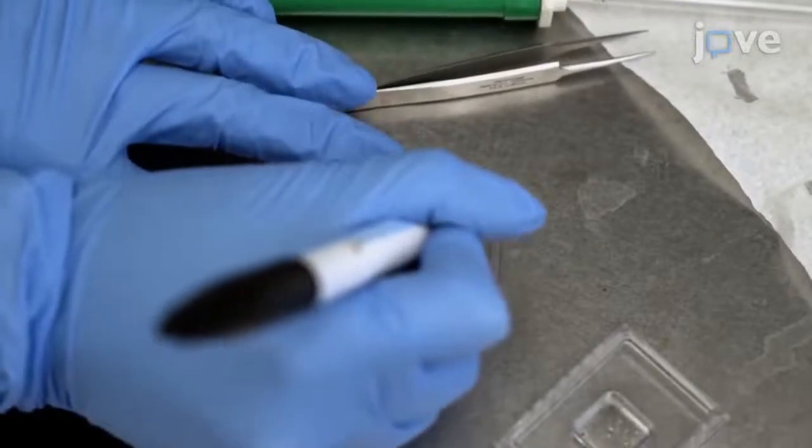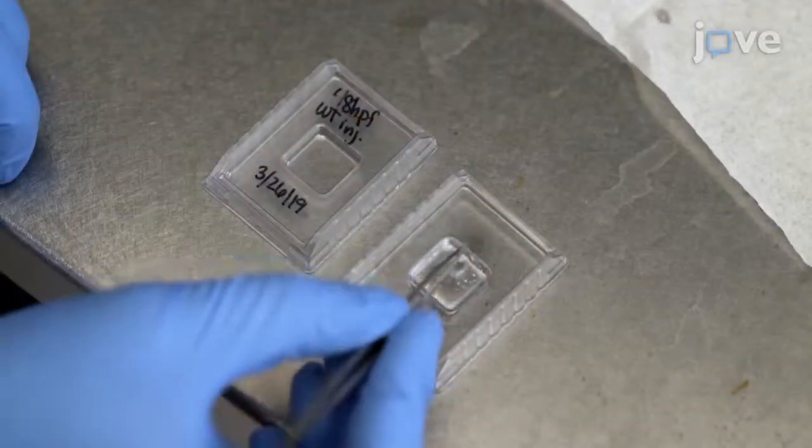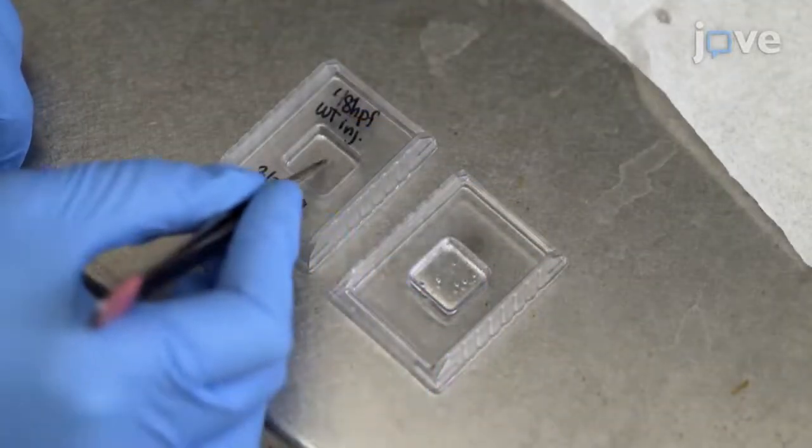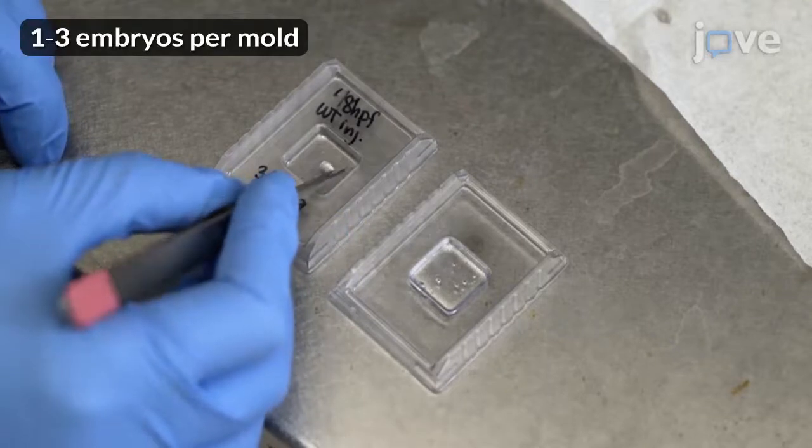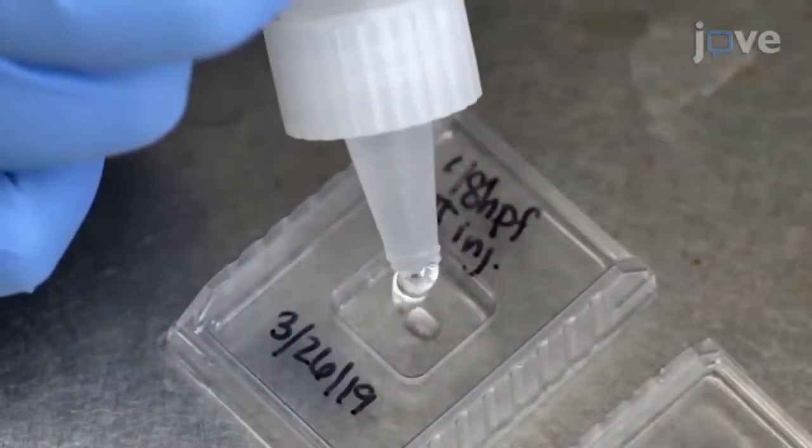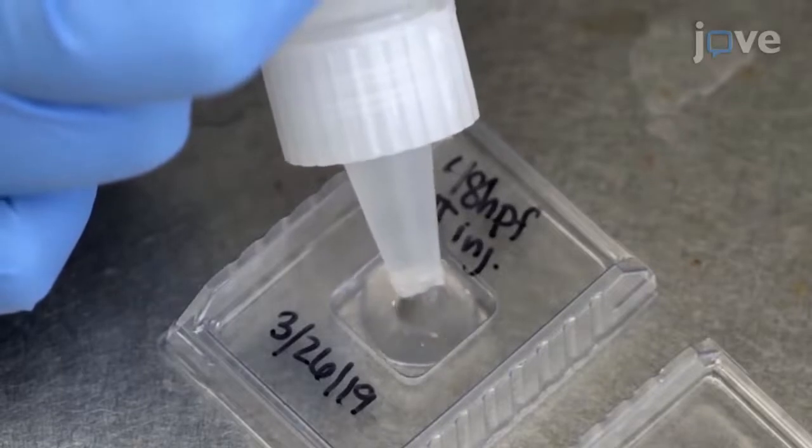Prepare labeled plastic molds and transfer desired embryos into the empty labeled plastic molds, minimizing carryover of OCT medium. Then gently fill with OCT medium to the top of the molds with embryos.